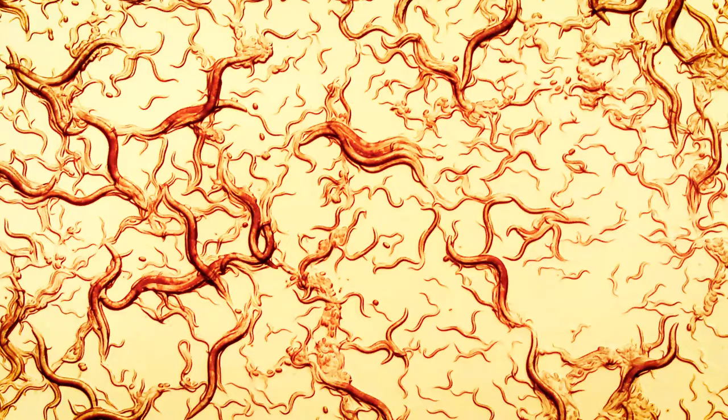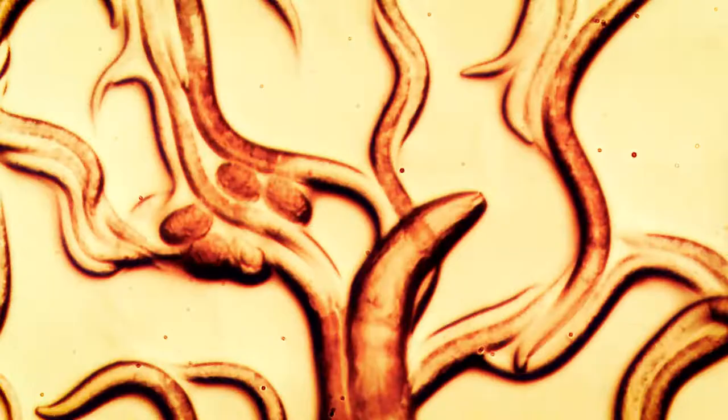I use Magnitude Bioscience's technology to screen for compounds that improve neurodegeneration, and I do this using the microscopic nematode C. elegans, which is essentially a worm.